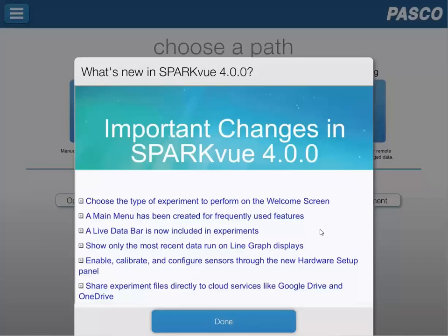We'll spend some time in additional videos discussing how to choose the type of experiment to perform on the welcome screen, discuss the changes on the main menu that's been created for frequently used features, a live data bar that's now included in the experiments and some of the features included within that, how to show only the most recent data run on the line graph displays, and some faster paths to enable, calibrate, and configure sensors through the new hardware setup panel. We'll also cover how to share experiments and journals with other apps like Google Drive and OneDrive.